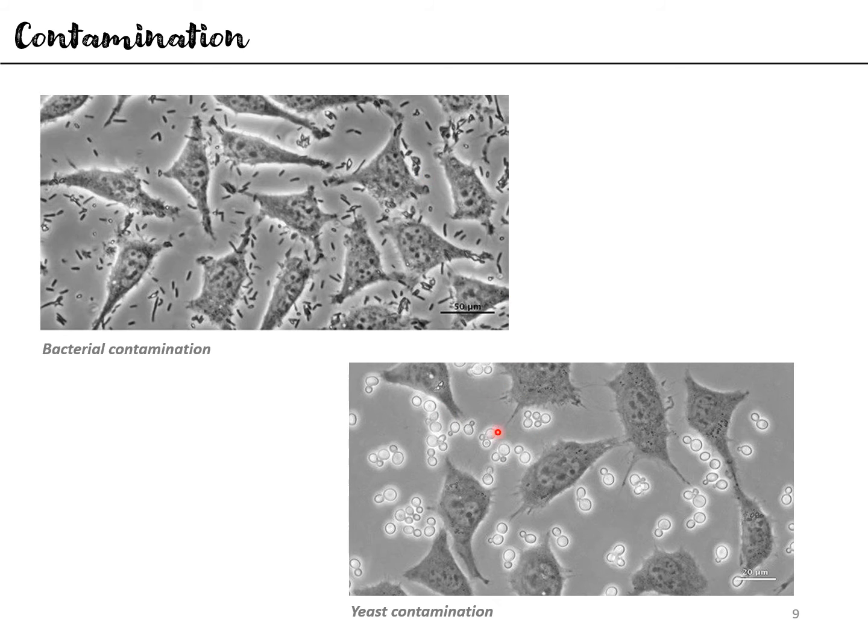So you can see these yeast particles, some are spherical, some are ovoid. In some cases you can see there's a small bud coming off from the bigger one. In this one you can see the bud coming out from the bigger sphere. So depending on what stage you're actually visualizing, you can see it.